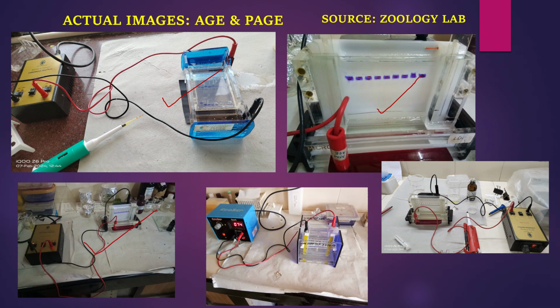This is also a PAGE. Only the first one is of agarose gel electrophoresis, which is a horizontal gel electrophoresis.